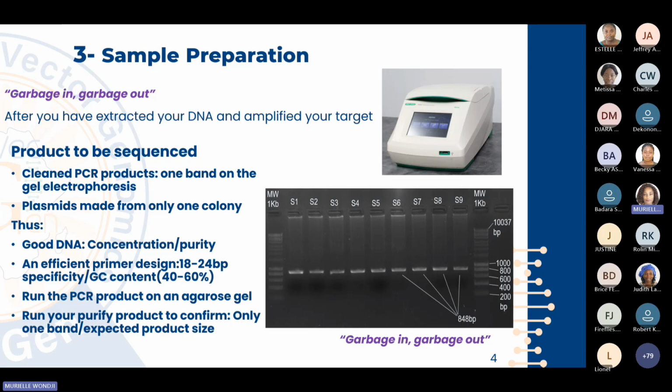You might have smears or a double band. If you have a double band, you can go for the extraction using the gel extraction kits before you send your product to the lab.